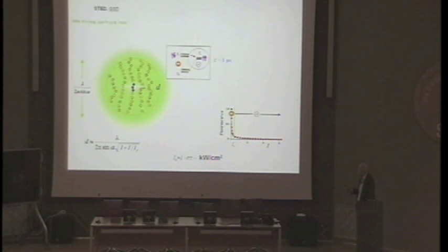And if they stay in a dark state, they stay there for longer because the transition from here to here is not allowed as a dipole transition, as physicists would say. And then it stays there for about a microsecond. And then the difference in states is maintained for longer. Okay? You pump it there. Here you have it in the bright state, here in the dark state. But this difference in states is now for a microsecond.